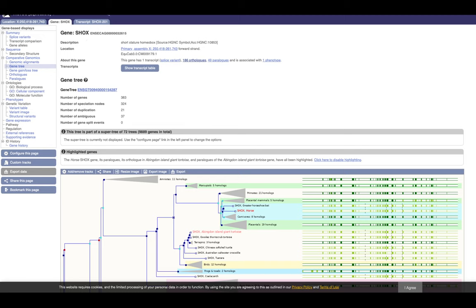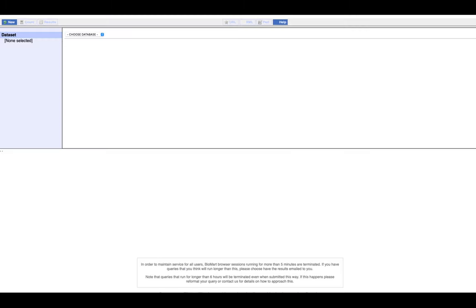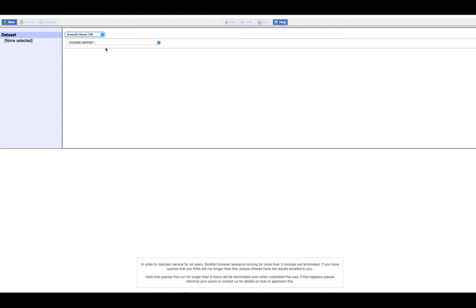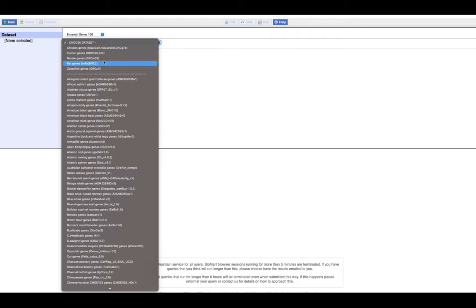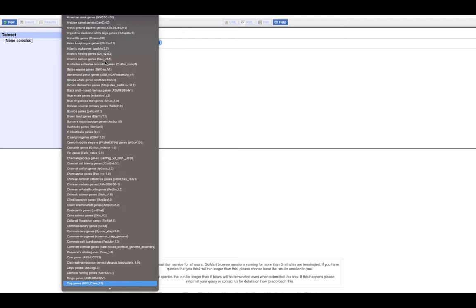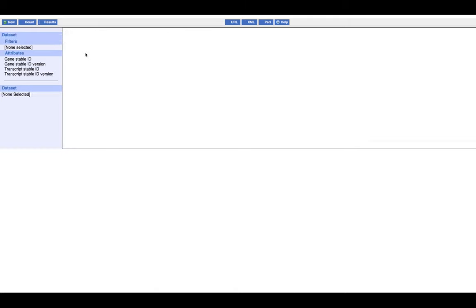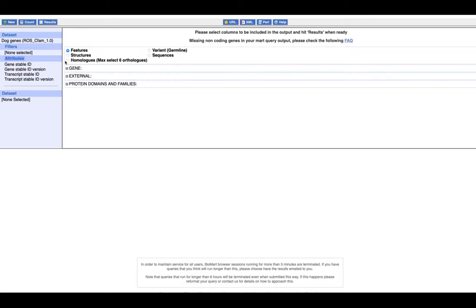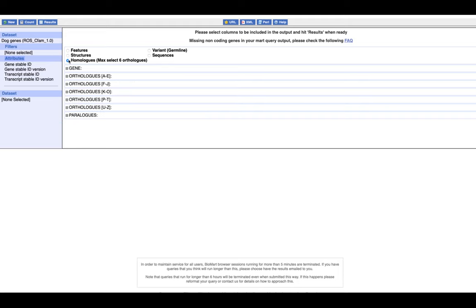Let's say you would like to extract the orthology for the whole genome. For that you can use BioMart. There is also possibility to use BioMart in R, but today I only show how you can extract this type of information through web interface. You select Ensembl Gene 108 version at the moment that I am using, and then let's say I would like to choose dog genome. Then you go to attributes.